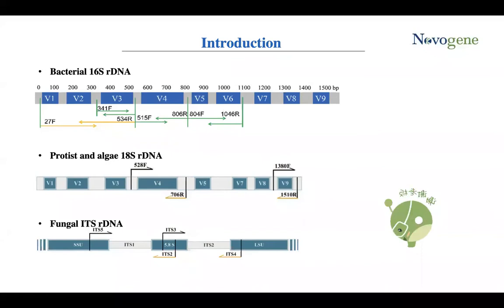to identify bacteria. What we usually do in amplicon sequencing is that we use universal primers that have binding sites on the conservative regions to amplify the target hypervariable regions out. And then we conduct the bioinformatic analysis to decide the phylogeny.